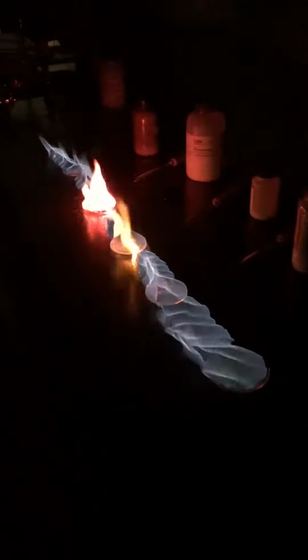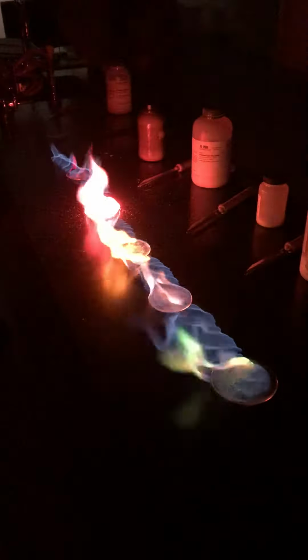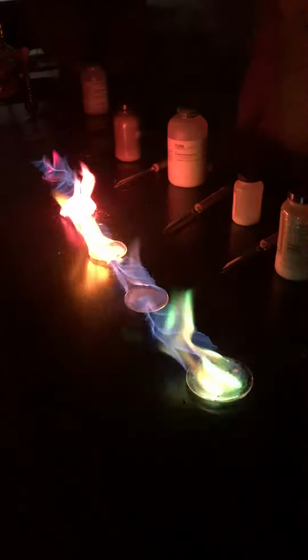Oh, damn. And then, a little green. It's like the Ghost Rider. Copper's going now. Yeah, so they're all going. What's this one? Magnesium? Is the red one magnesium?